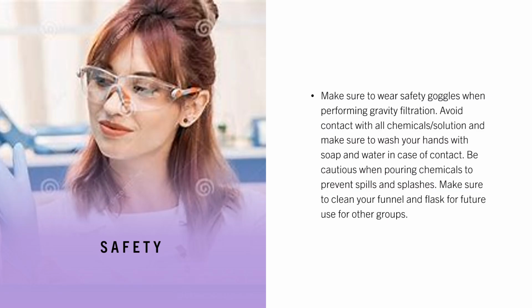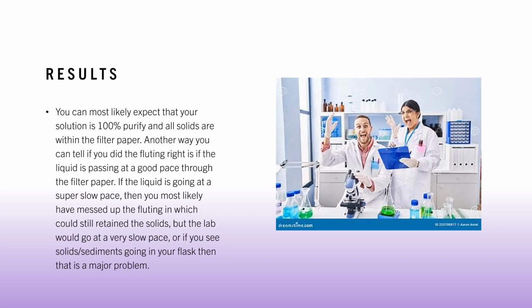Safety. Make sure to wear goggles when performing gravity filtration. Avoid contact with all chemicals/solution, especially when it gets on your skin, and make sure you wash your hands with soap and water in case of contact. Be cautious when pouring chemicals to prevent spills and splashes, and make sure to clean your funnel and flask for future use for other groups.